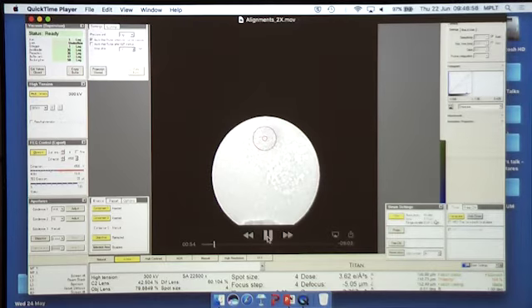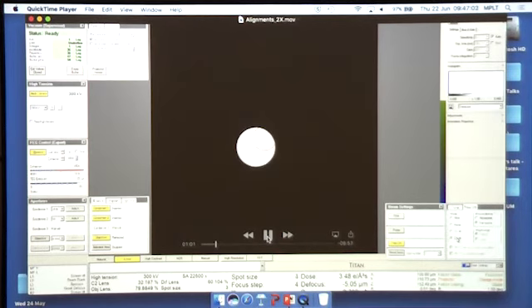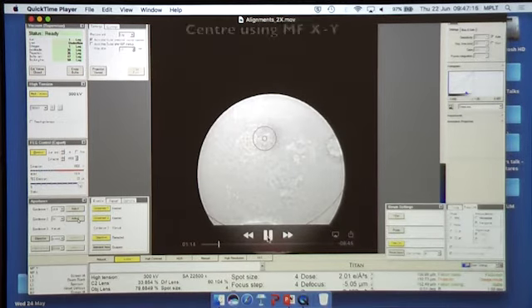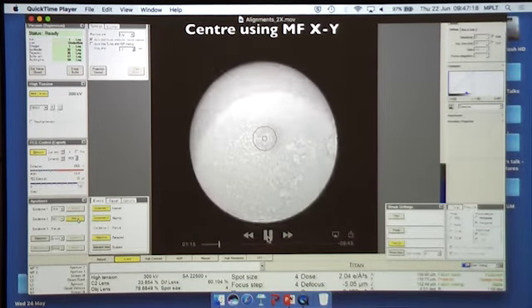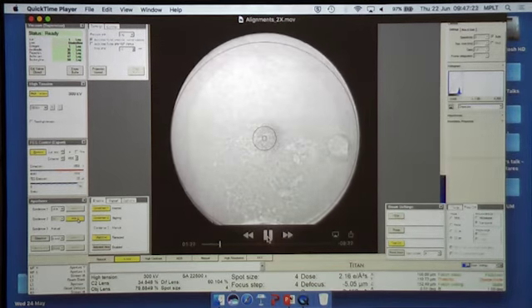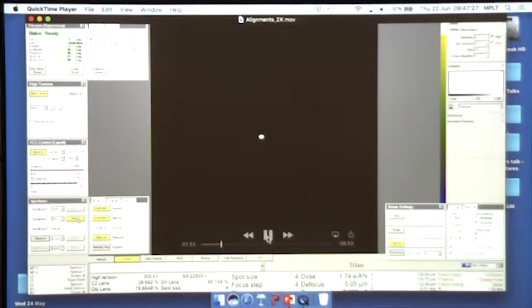So what we do is we go into free control and turn the third condenser lens off, and now we've got a Techni microscope with just 2 condenser lenses. To center the beam, go to crossover, so make the beam as small as possible, shift it with your deflection coils to the center of the screen, and then expand it. If the aperture is not centered, it will shift to one side. Activate your adjustment feature and then recenter mechanically using the multifunction X and Y.